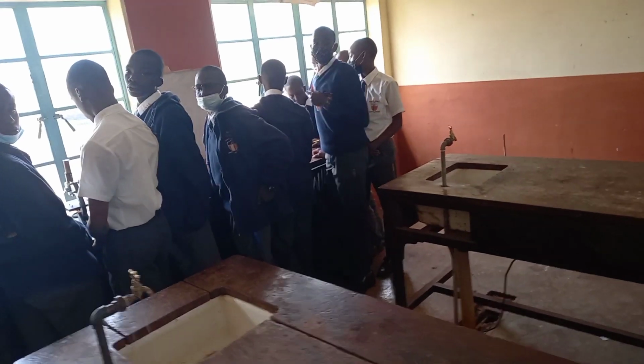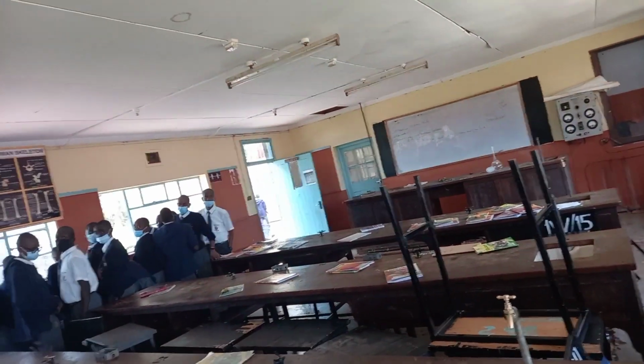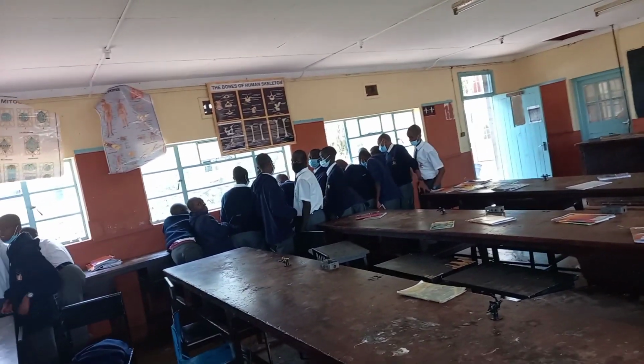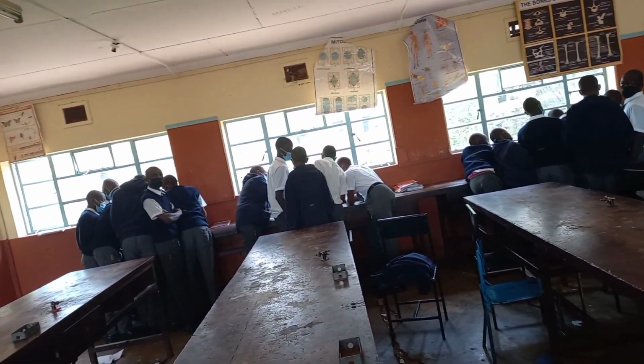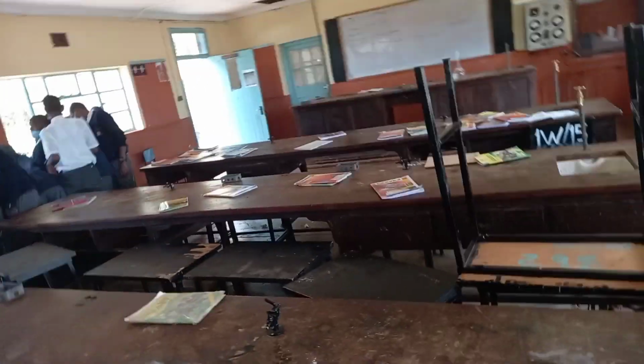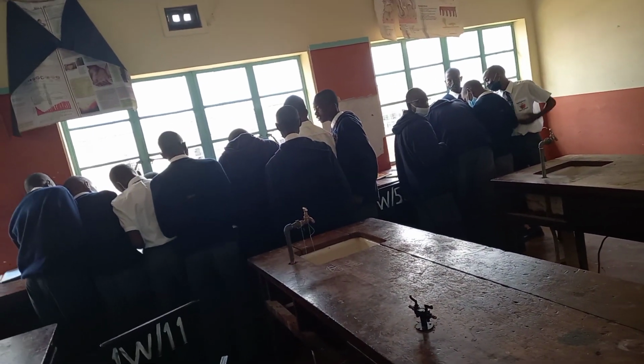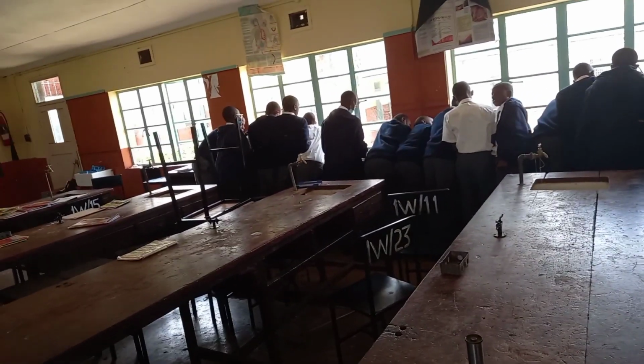Again, look through the eyepiece while adjusting the mirror under the stage to ensure that sufficient light is passing through the specimen. Use the coarse adjustment knob to bring the low power objective lens to the lowest point. Then, viewing through the eyepiece, turn the coarse adjustment knob gently up until the specimen comes into focus. Use the fine adjustment knob to bring the image into sharp focus.